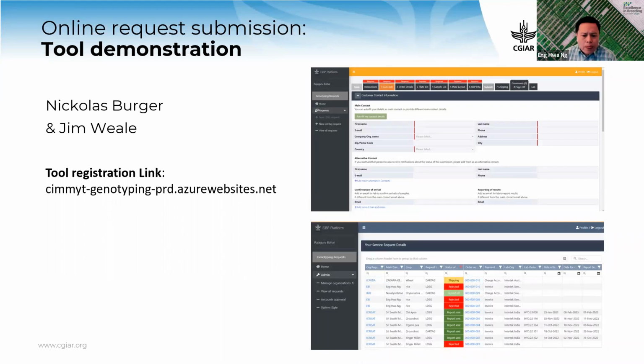this submission tool. Again, before I hand over the floor to Nick, please type in your questions if you have any, and raise hands if you want to ask live questions. Thanks. I'll hand over to you, Nick. I'll stop sharing. Great. Thanks very much, Eng.